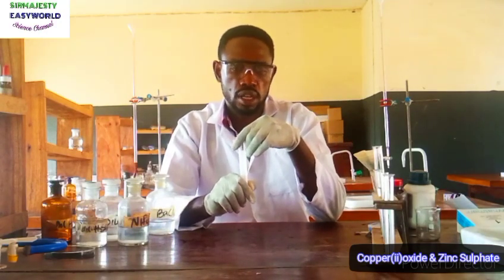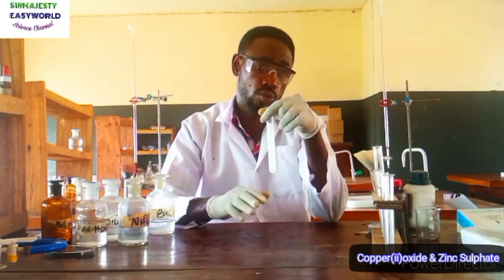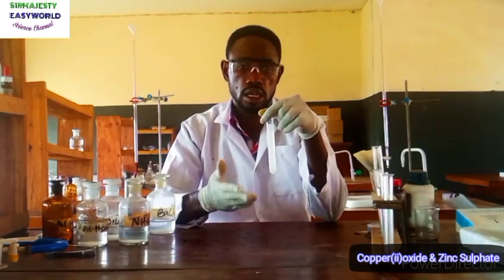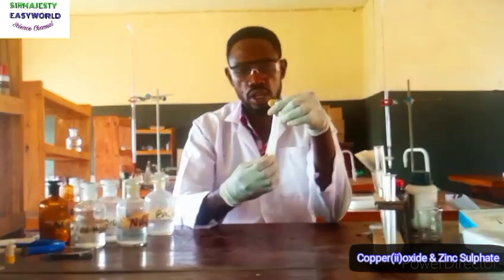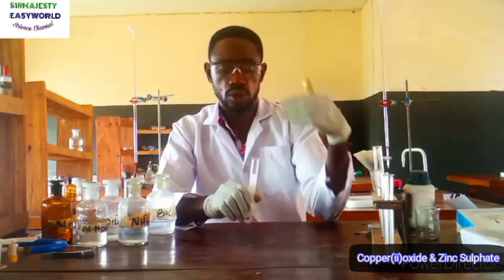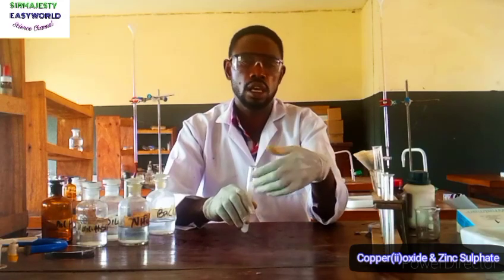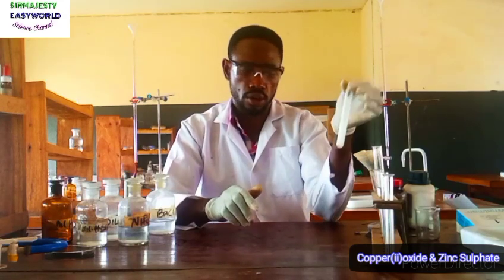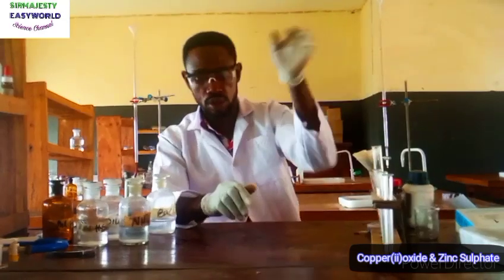So in your inference, when you add barium chloride, write SO4 2-, CO3 2-, or SO3 2- suspected. Then, since it persists in dilute acid, you write SO4 2- confirmed. So this has confirmed that the unknown sample I'm analyzing contains sulphate 6 ion. So we are done with the filtrate according to the instruction.